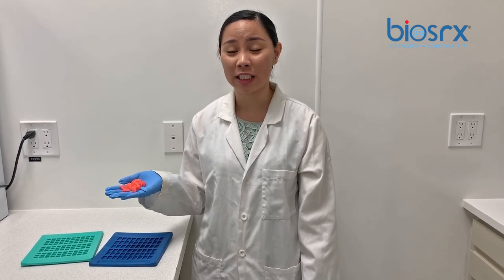These are the trochees that came out of the one-milliliter RD trochee molds from BiosRX. This is great and useful when compounding LDN trochees. With a single cut, you can get a quarter trochee, a half trochee, a three-quarters trochee, up to four pieces.